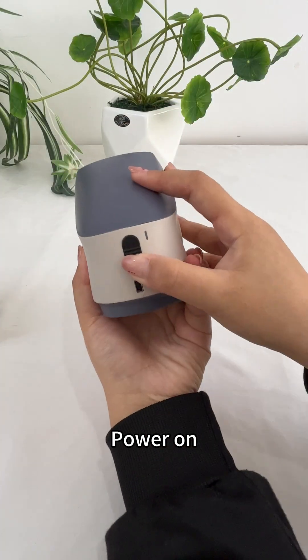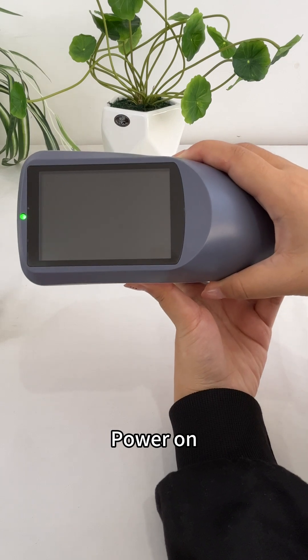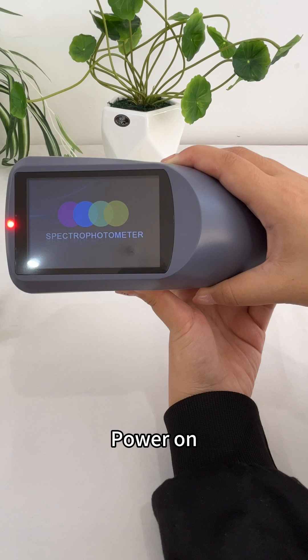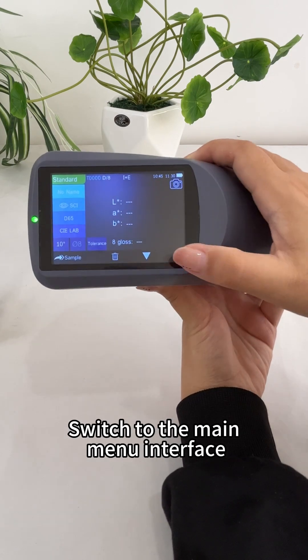Power on. Switch to the main menu interface.